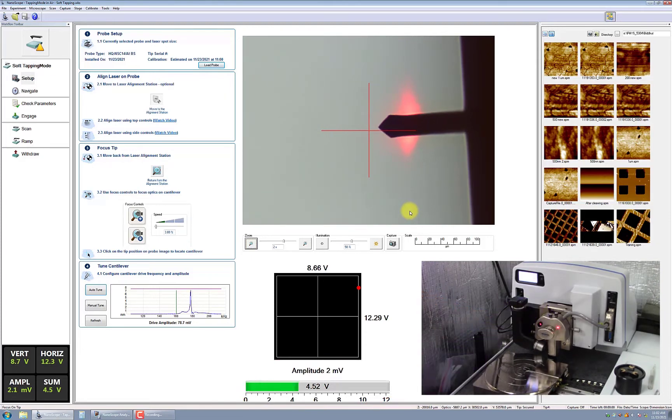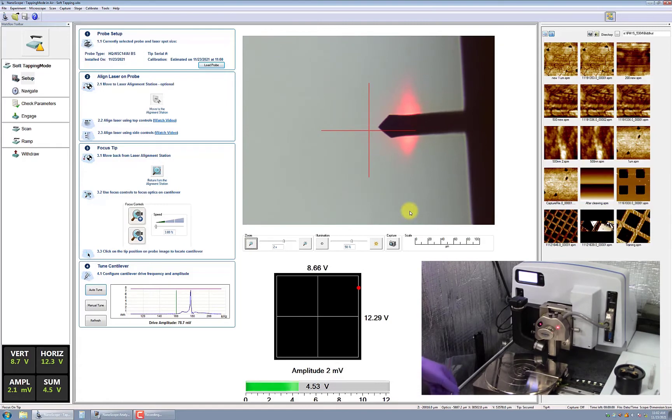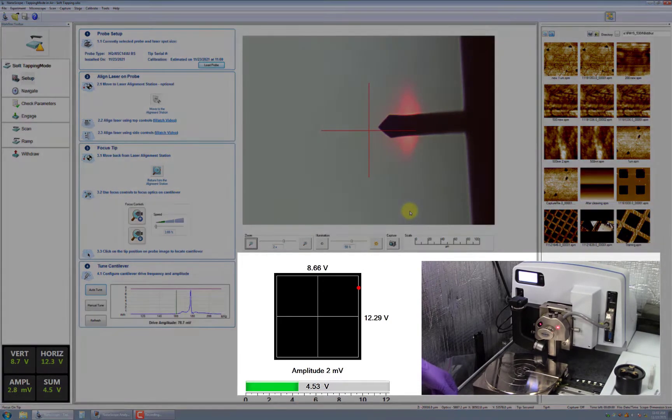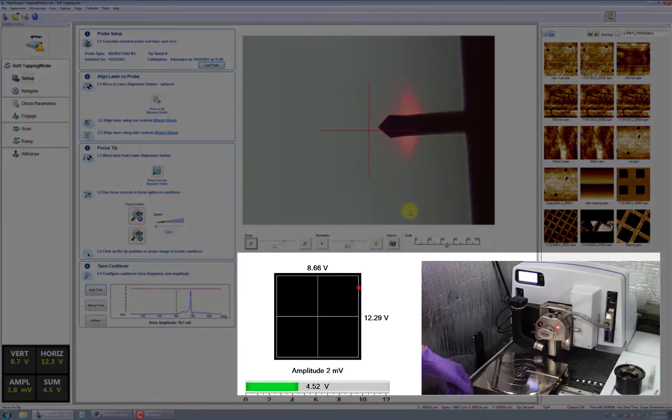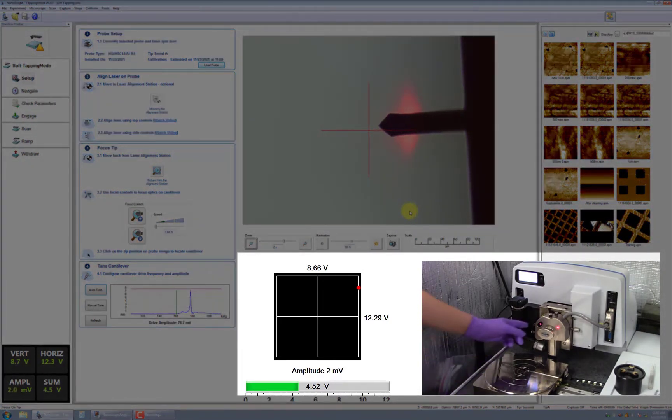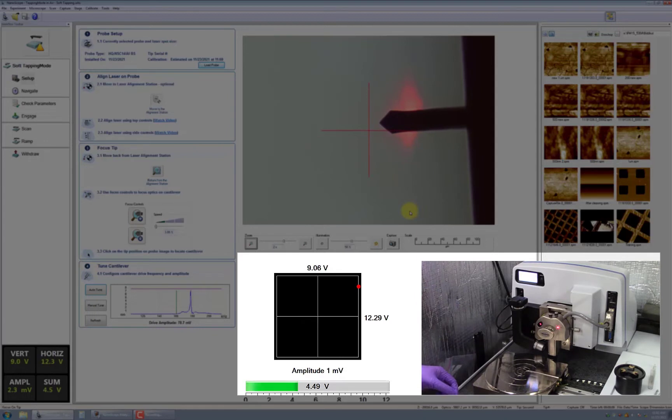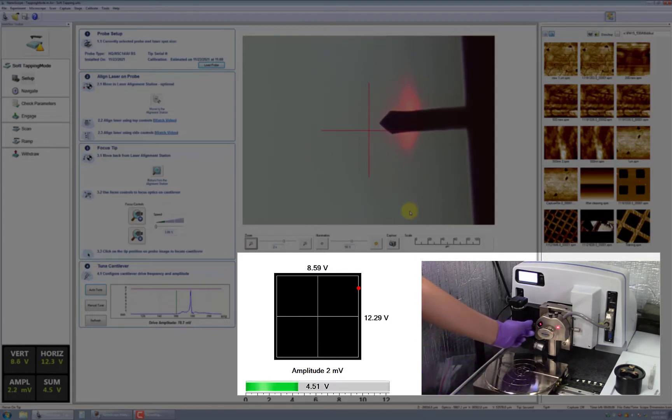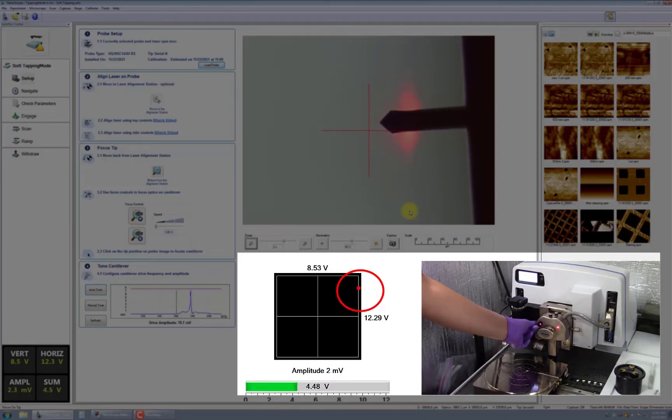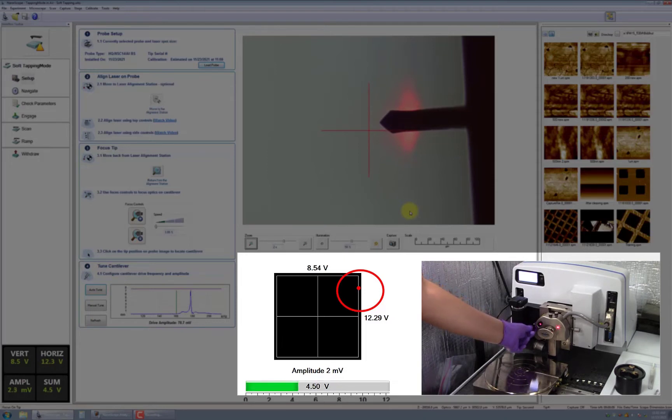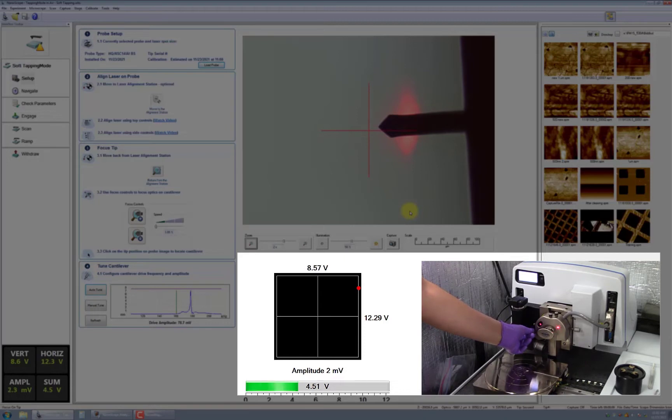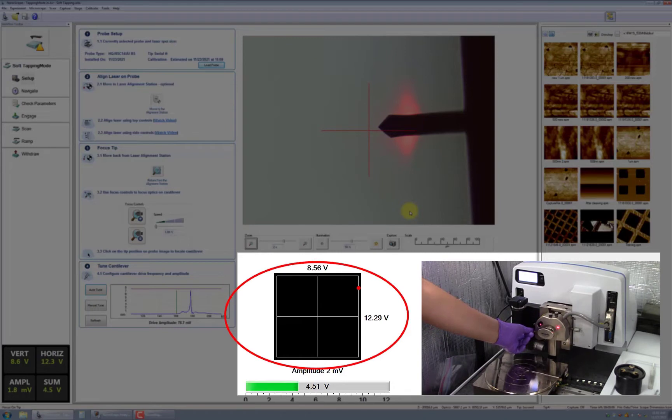Next, you'll need to align the photodiode. This is done by adjusting the x- and y-axis photodiode knobs located on the side of the scan head to move the red dot roughly to the center of the cross shown in the box above the amplitude signal. Fine-tune the photodiode knobs so that both the horizontal and vertical deflection values are less than 0.1 volts.